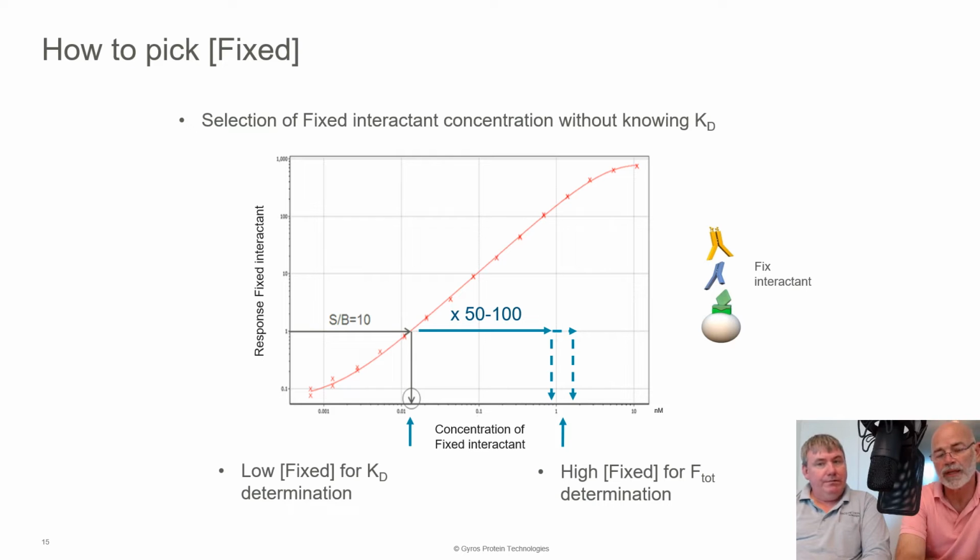Yeah. So in that stoichiometrically controlled situation, you're going to more accurately determine the active concentration that you're working with. So again, it's a bit of a hunting expedition to sort out. But if you start at tenfold over background and then you incrementally titrate up towards 50, you'll probably hit a couple of points that will be reasonably good KD controlled curves that will give you some wiggle room in terms of hitting a reasonable KD.